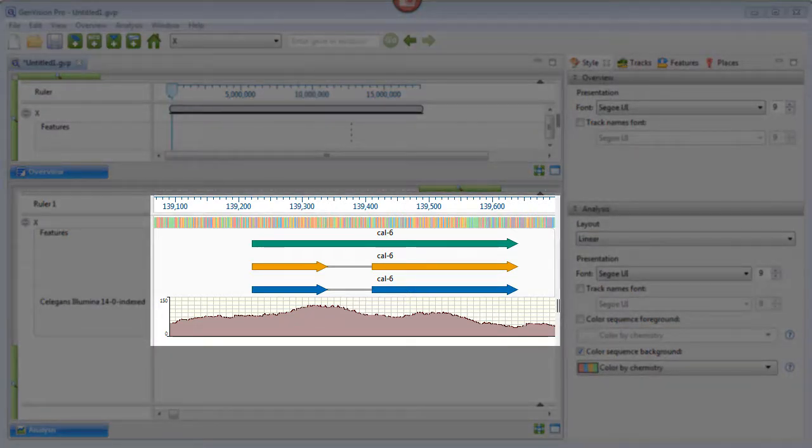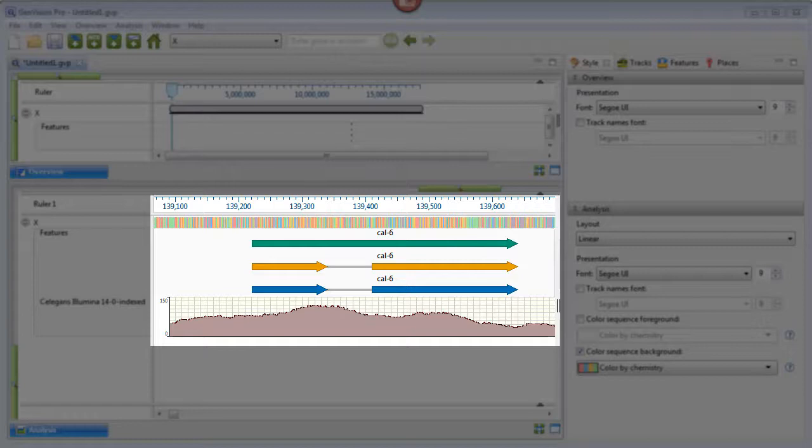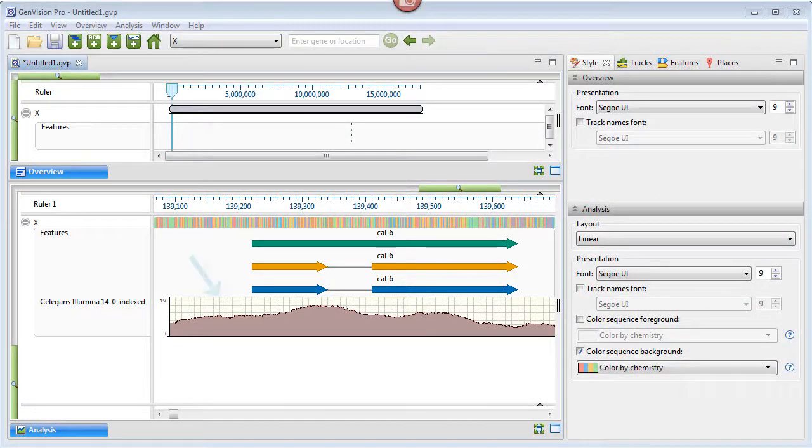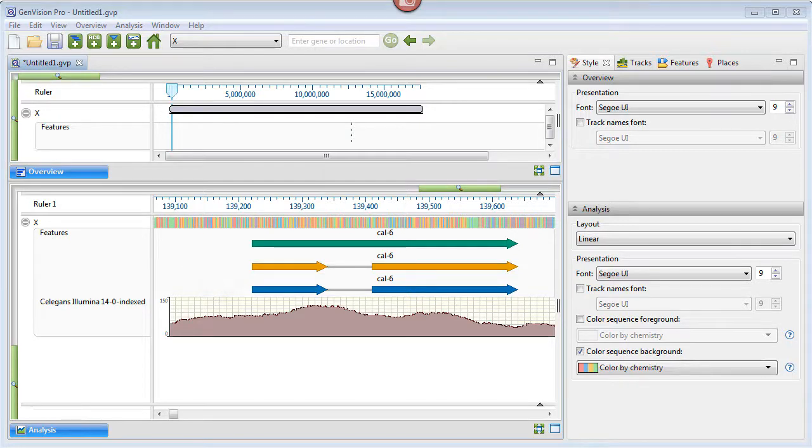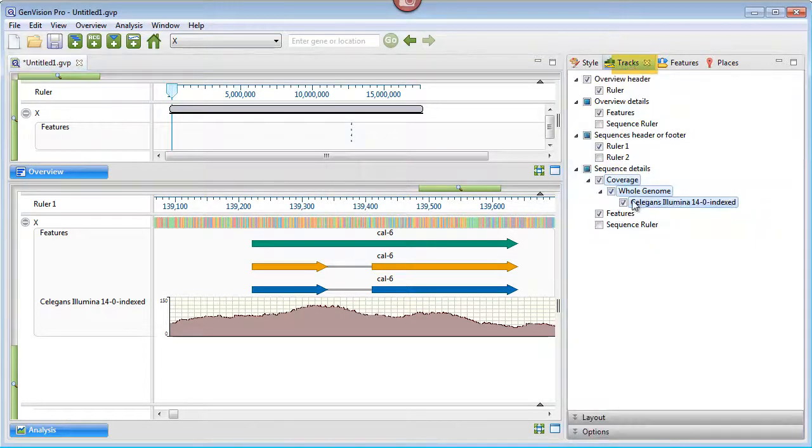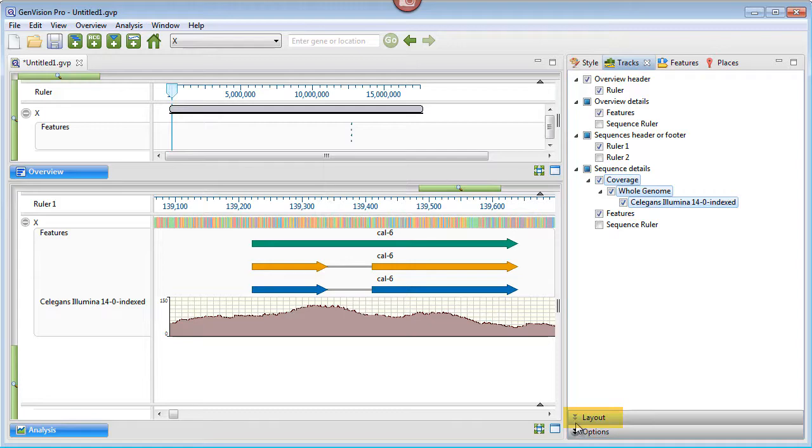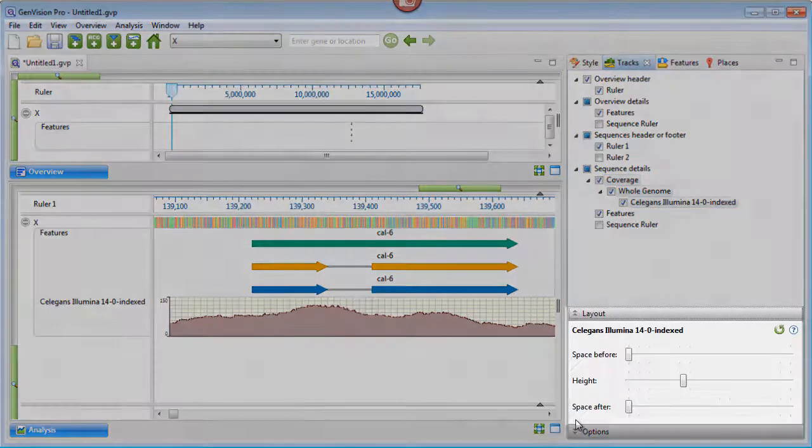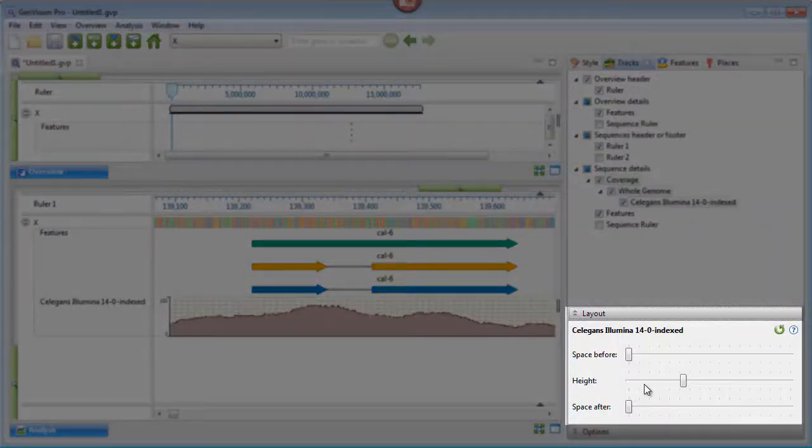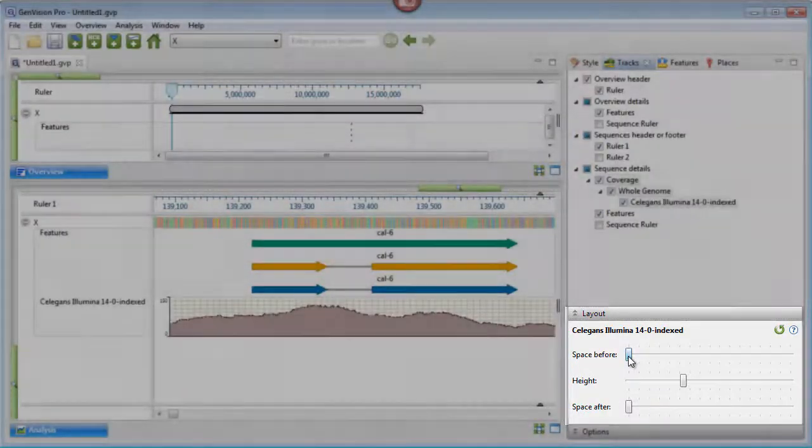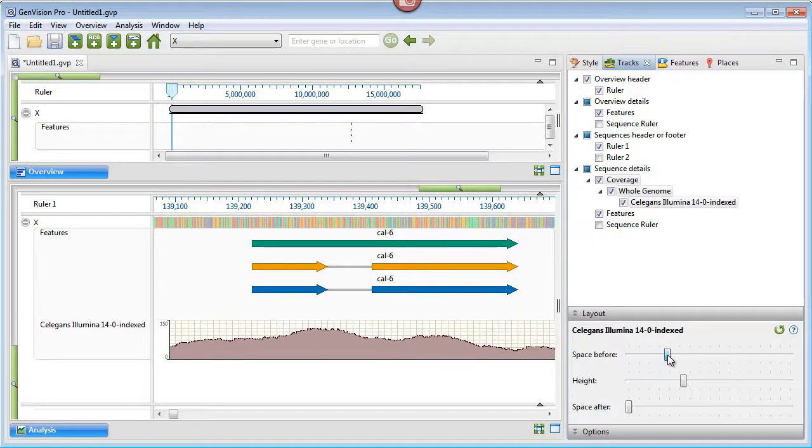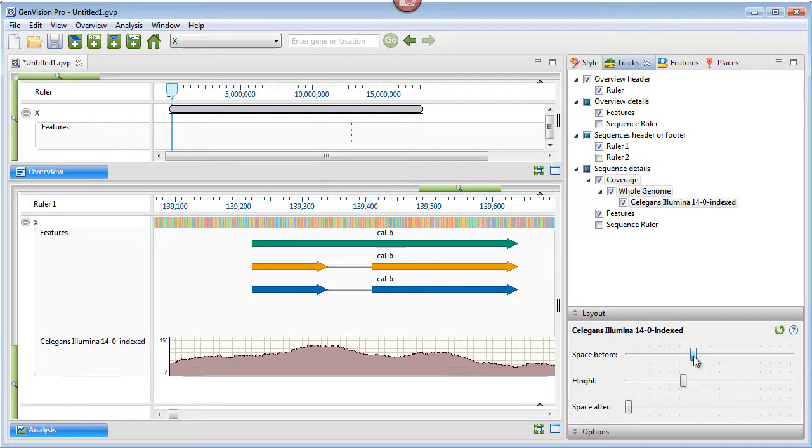Before I export everything that is visible in the analysis view, I'm going to add some white space above the coverage graph. This space will be a placeholder for an annotation I plan to add within PowerPoint. To do this, I'll click on the Tracks tab, make sure that Coverage is selected, and then open the Layout area. I can use the Space Before slider to add some space just above the coverage graph.